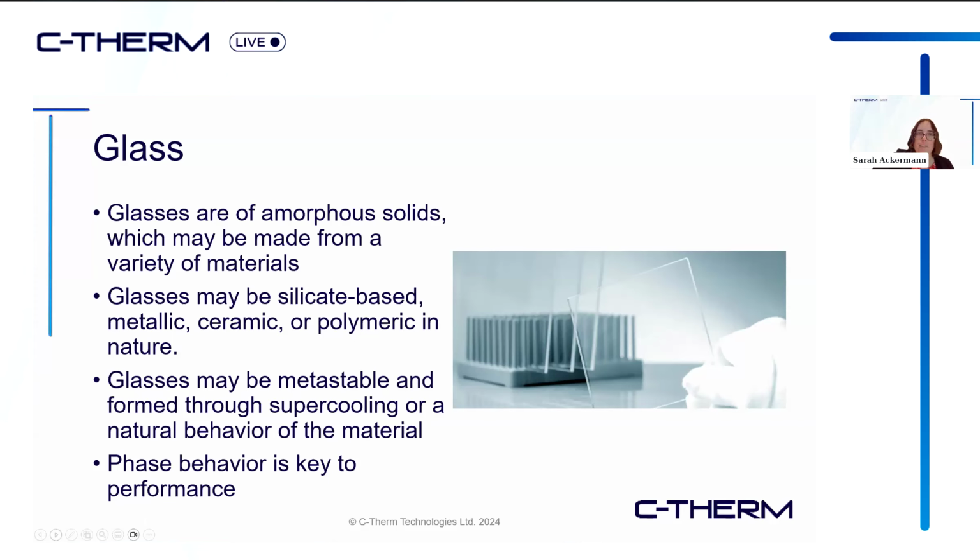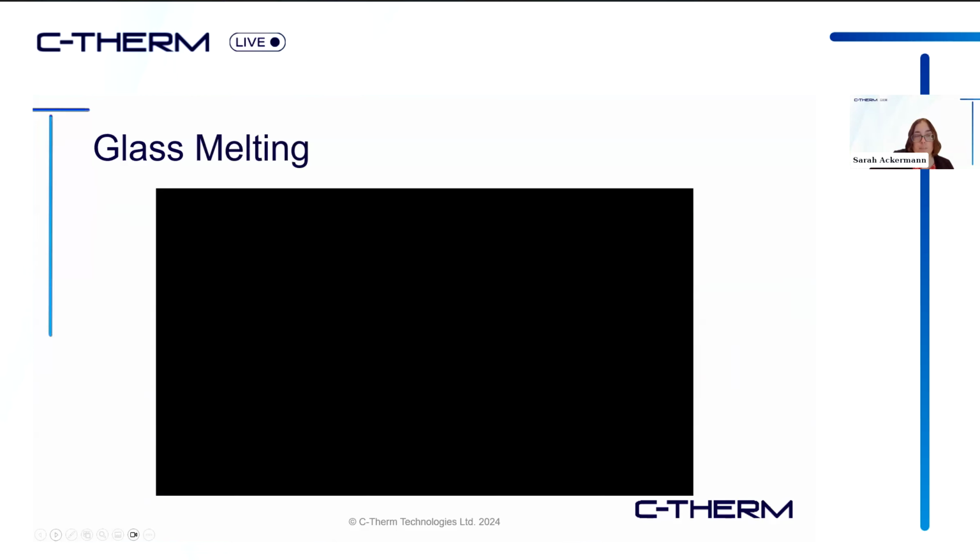We have the glass transition temperatures that I identified previously, where the material is transitioning from a glassy state to the rubbery state. So those are also good examples of a natural glass material, or rather a glass which is an inherent property of the material, I should say.